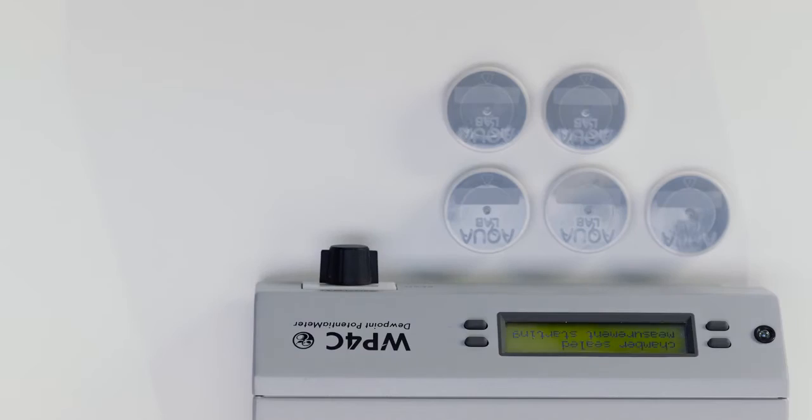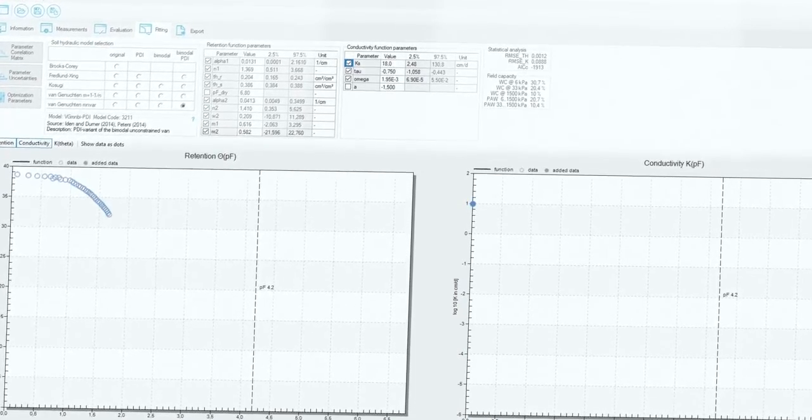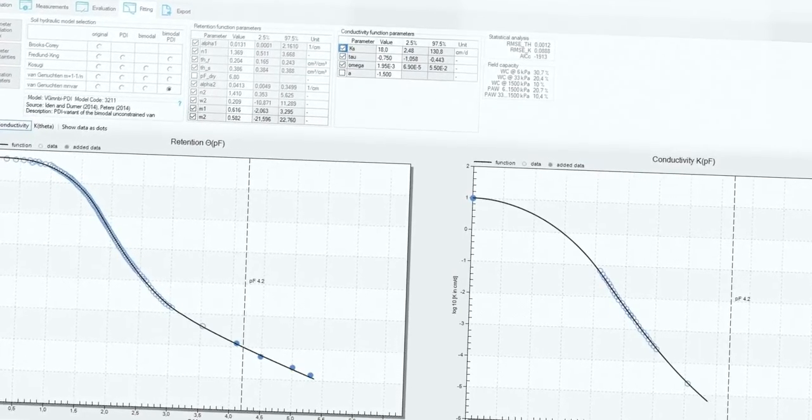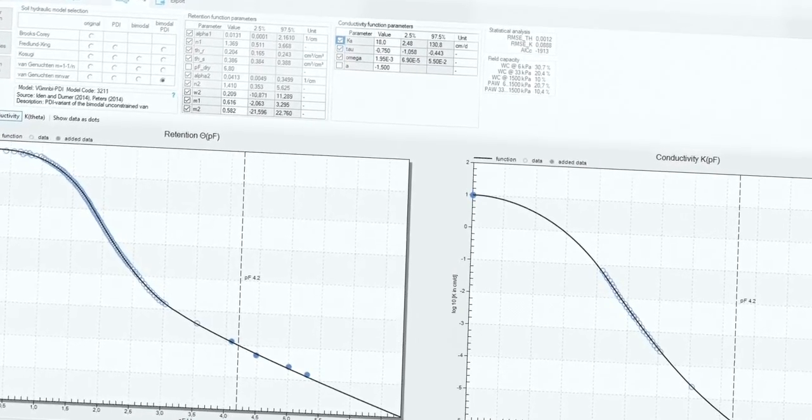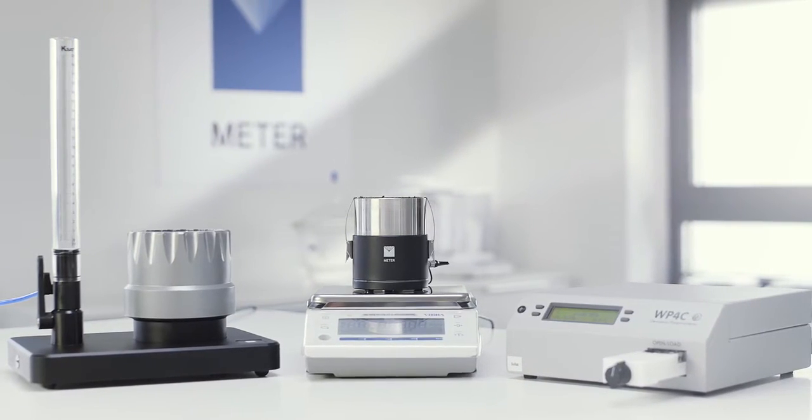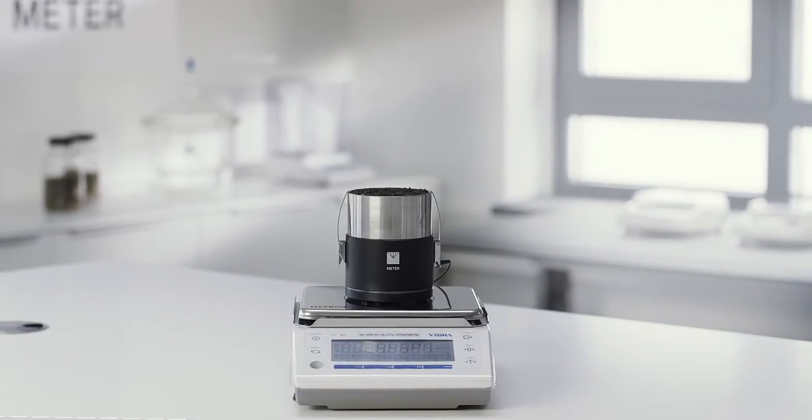Each measurement sets the standard for precision, and the whole process is more streamlined and less error-prone than ever before. Of course, Labros gives you full flexibility. Each device on its own is a great solution, but the more you combine them, the more time, energy, and money you save.